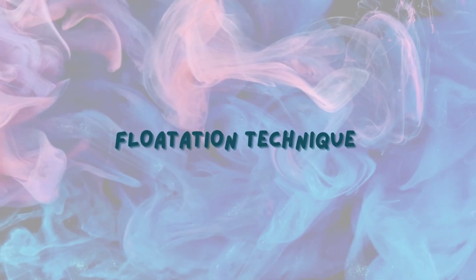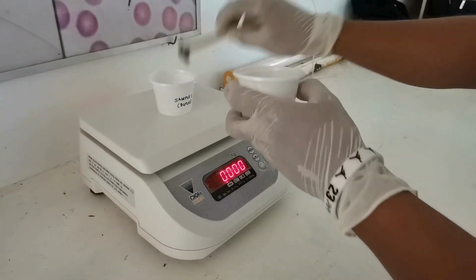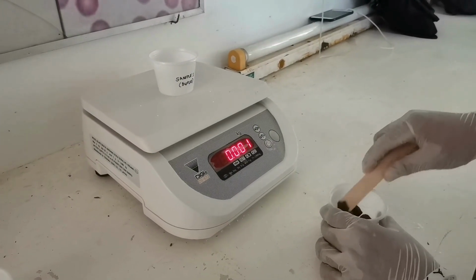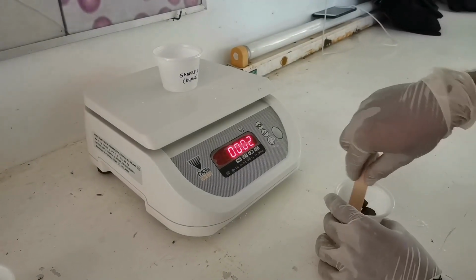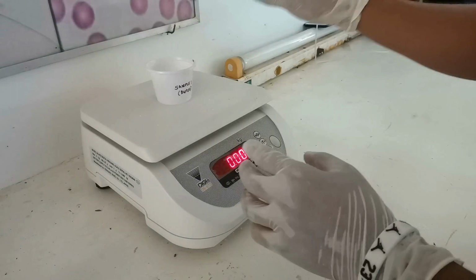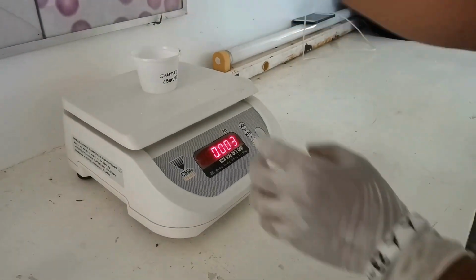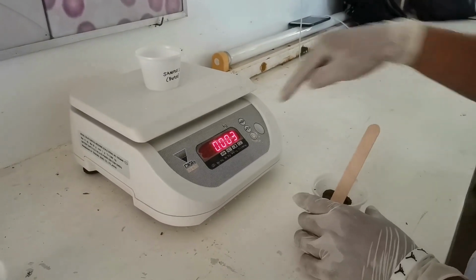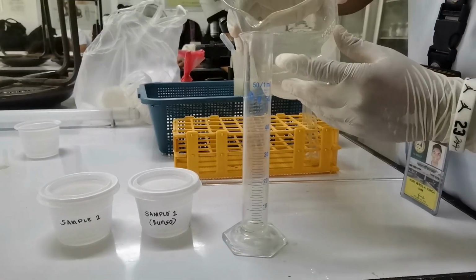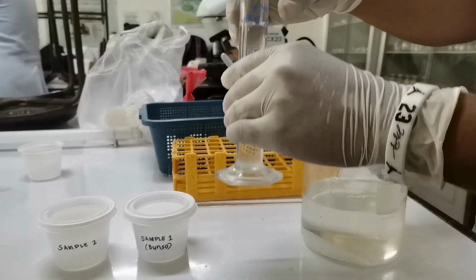Methods in performing simple test tube flotation. 3 grams of feces were measured in the weighing scale placed in a plastic cup. 47.5 ml of saturated saline solution was added and mixed until the feces is well dispersed.